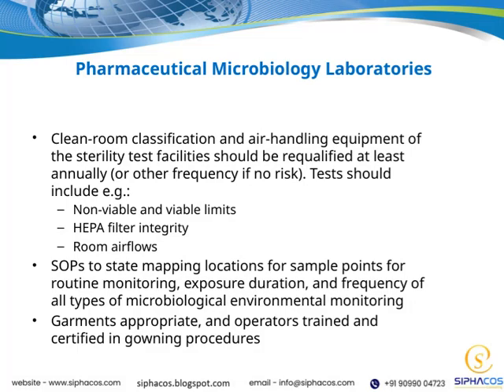When it comes to pharmaceutical microbiology laboratories, maintaining a high level of cleanliness and proper air handling is absolutely essential. That's why the cleanroom classification and the air handling equipment in our sterility test facilities should be requalified at least once a year. Of course, if there's no significant risk, the frequency can be adjusted, but regular requalification is key.